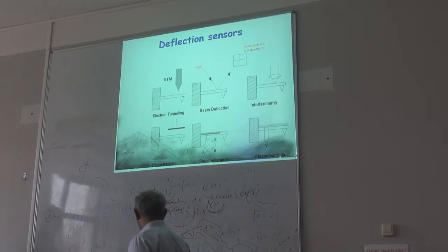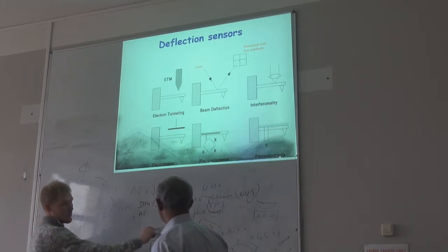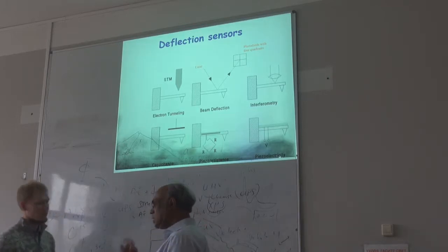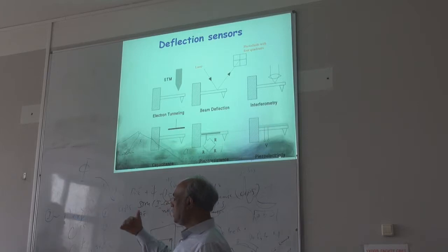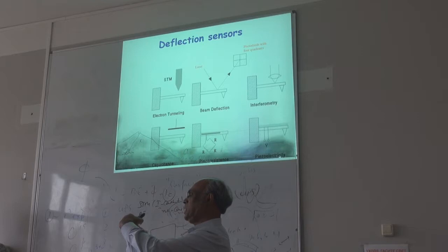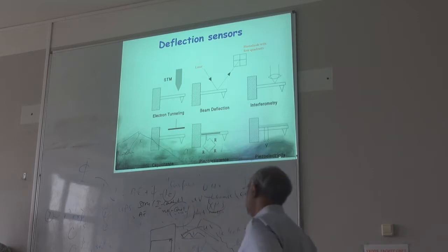If you have many layers, then the height will be larger, and you can decide on one layer. Typically one layer is about 0.7 nanometers because there is some air between the substrate and the first layer, and also some van der Waals force. So usually this thickness is about 0.7 nanometers.